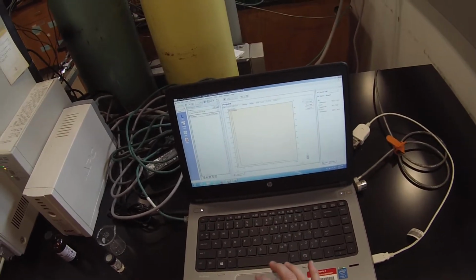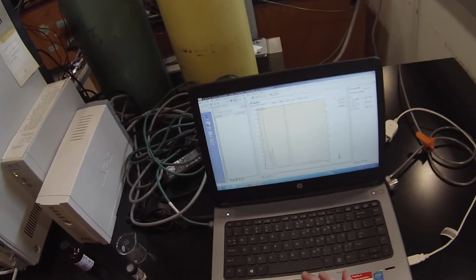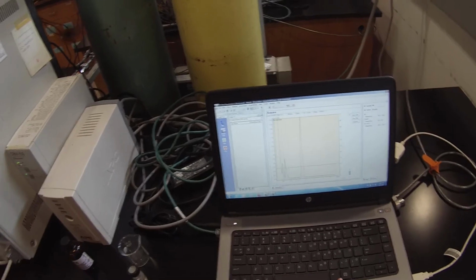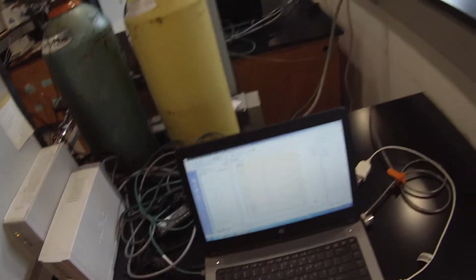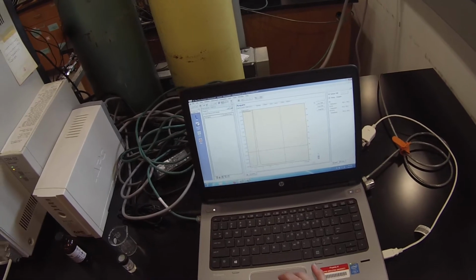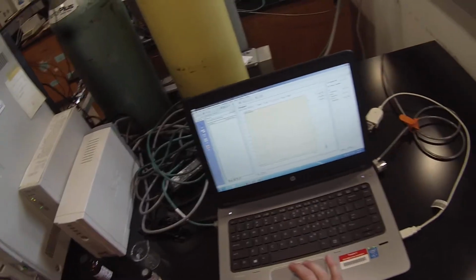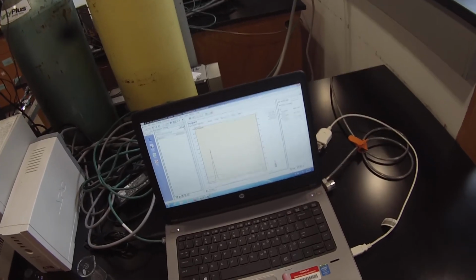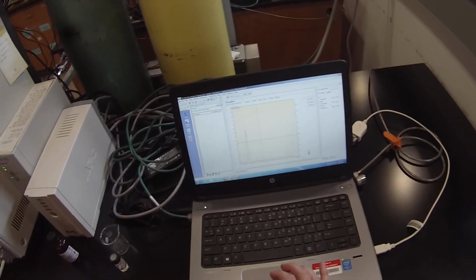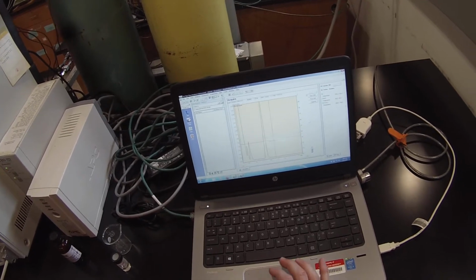If I blow these up, you'll see there's a lot more solvent than there is product. So this is probably another solvent peak. We got our chloride and our bromide. Or perhaps that's the chloride and the bromide's not off yet because we're only at 1.8 minutes. Undo my zoom.